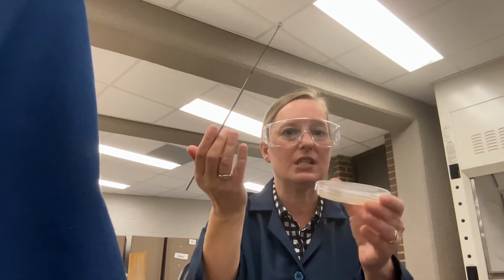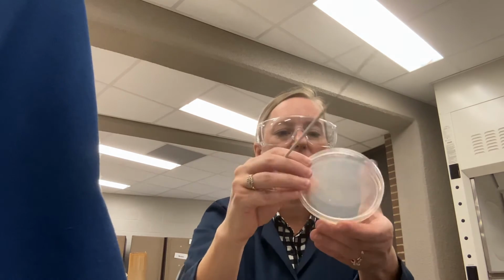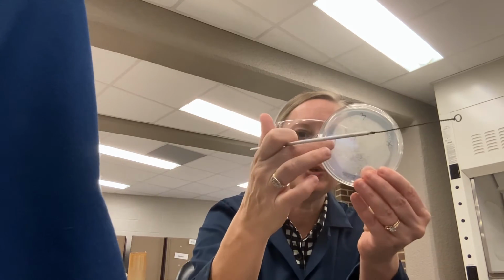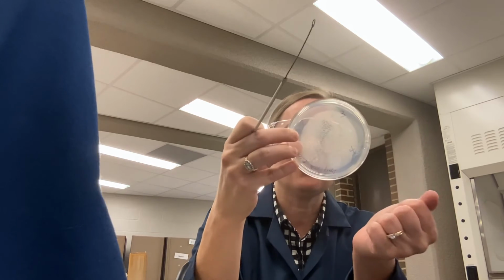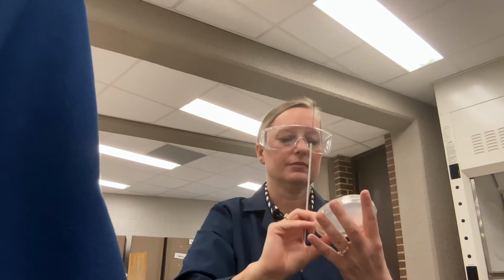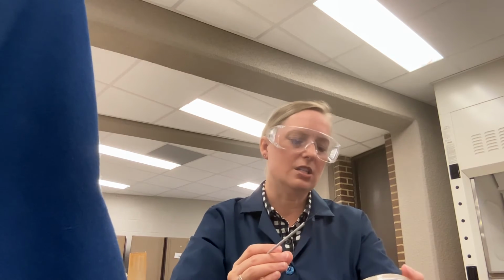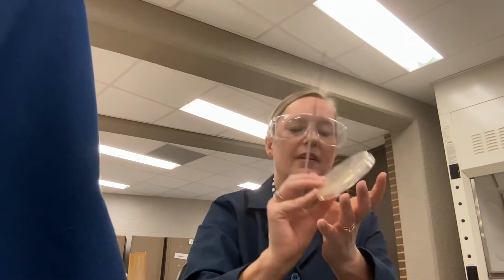And the purpose is to get this streak plate, these isolated colonies. So now I'm going to drag. Here was my zone 2. I'm going to go from 2 to 3. Actually, I already did 2 to 3. I'm going to go from 3 to 4. So there's 3. I'm going to go from 3 to 4, and that's my last one.